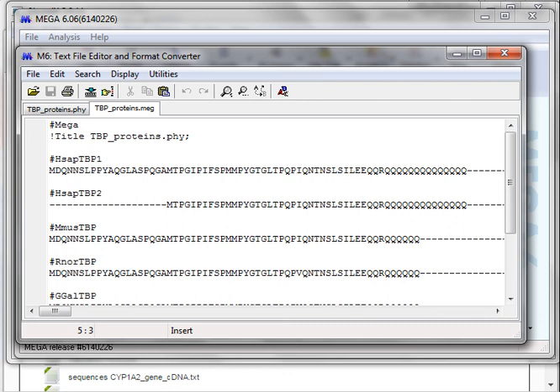And you can display also the branch sizes. And you have here there is no distance between the two TBPs from homo sapiens isoforms. And you have no different or slight difference between both rodents. And then you have a long distance to Drosophila melanogaster. This is the way you can choose to relate organisms. Or if you have different proteins, you can relate the proteins and check a protein study. If they are, if it is closest to certain function compared to others.